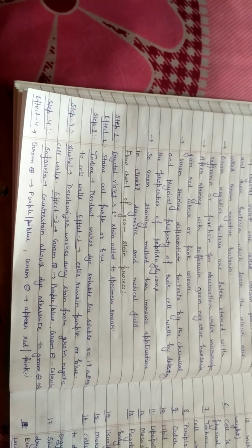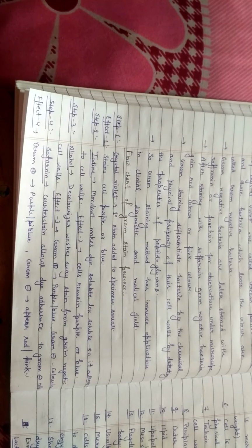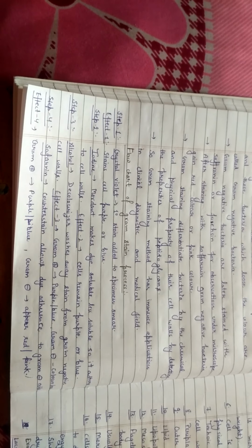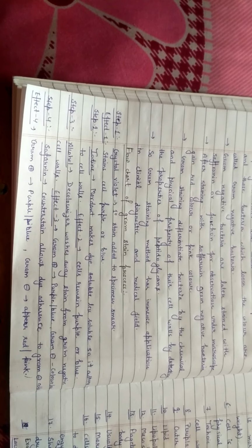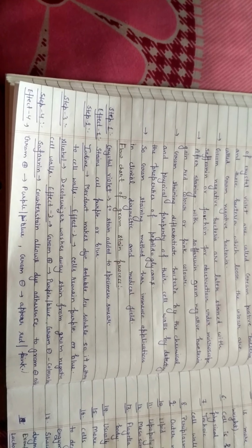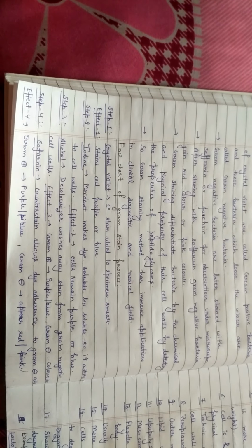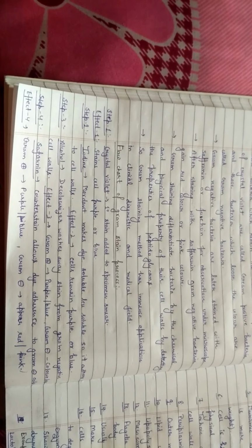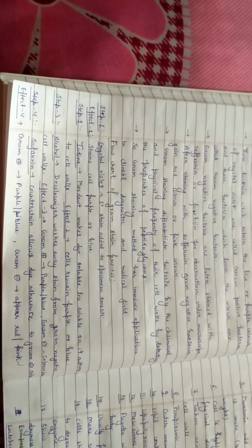So we can say that there are basically four steps. The first step is treatment with crystal violet. After that, both bacterial species become purplish or bluish in color. The second step is treatment with iodine or Lugol solution. The effect of the iodine is that both cells remain purple or bluish, but the crystal violet dye becomes less soluble, and that's why it adheres more to the cell wall of the bacterial species.